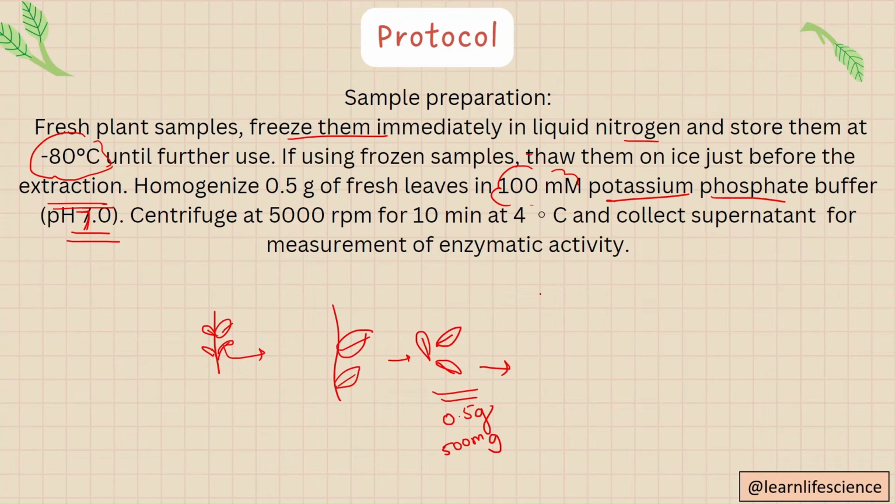Many times when we are reading different papers, we see that they are carrying out every experimental activity related to plants in buffer, which is also termed extraction buffer.